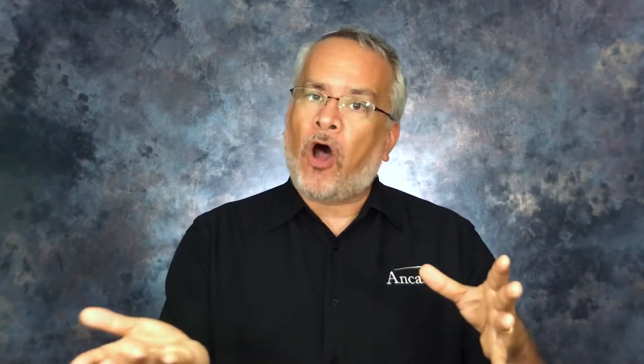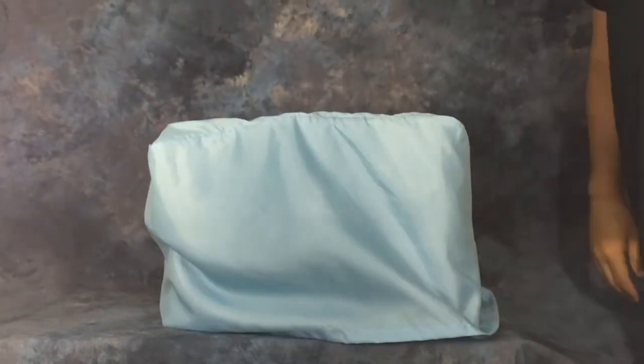And we are Ancare, so you do know that we're all about style — and that's why we have so many different styles of covers available. We have a toaster cover style, which is essentially like a box with an open bottom that allows you to drape it over whatever item you're trying to cover — fantastic for bottle baskets. We have covers with zippers, which are great for larger items like our bulk trucks, and those covers are in stock. They have zippers along either front edge that you lift up and then flip back the flap to get access to whatever's inside. And then we have bags with zippers as well, also in stock for Ancare standard bottle baskets — great for any bag application where you want the ease and convenience of just zipping a zipper to close them.